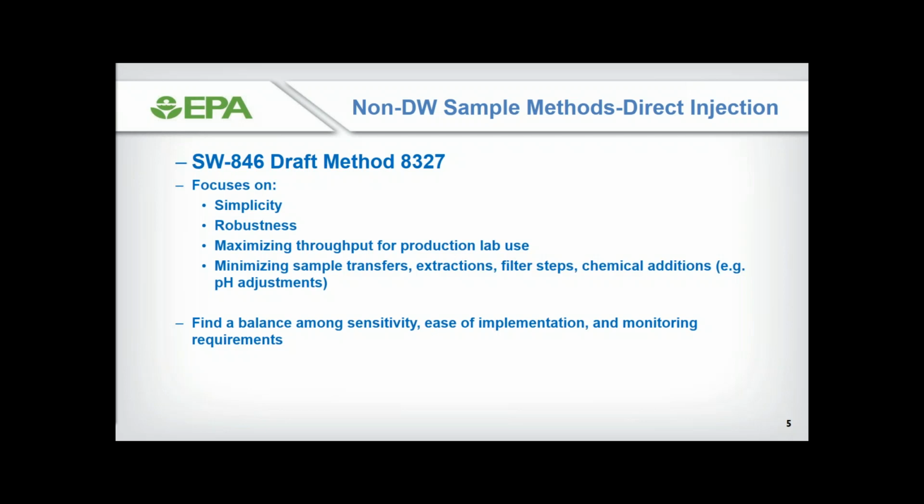It's a direct injection, so it really minimizes sample transfers, any contact with extractions or other equipment. It is a very direct way of getting your sample from the field into the instrument with a minimal contact with anything else involved. And we all know that contamination can be a big issue in analyzing for these compounds. We hope to find a balance among sensitivity, ease of implementation, and monitoring requirements for this method.